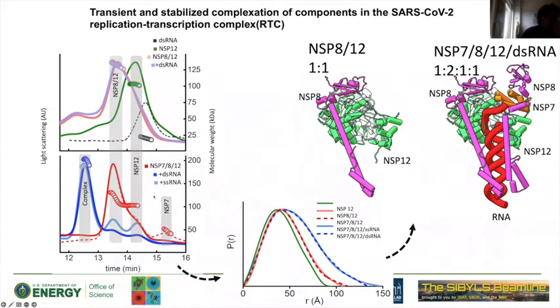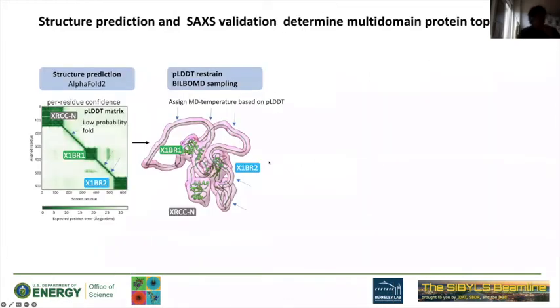But obviously, modeling this SAXS data and matching it to cryo-EM structures, to find out the transient complexation and what is important to the assembly of this large transcription complex, is something SEC-SAXS allowed us to do, because we separate all those non-complex states from the complex. We still have pieces of non-complex states in the sample. This is an example of where we go.